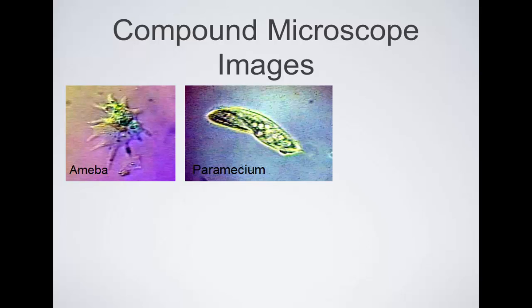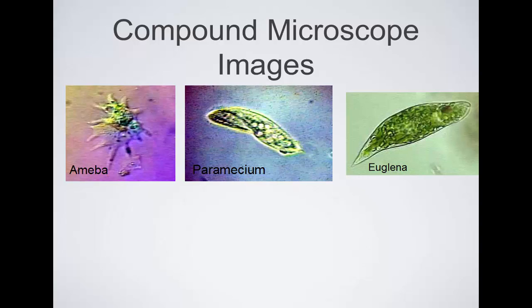This is another single-celled protist. This is a paramecium. Again, it's a single cell, but it's alive. It's moving. You can see it move through the water. These are the kind of things scientists didn't know existed until microscopes were invented, because these are very, very small organisms that you cannot see really with your naked eye. So once they started looking at things in the microscope, they started to discover that there is life that's much smaller than we had thought about.